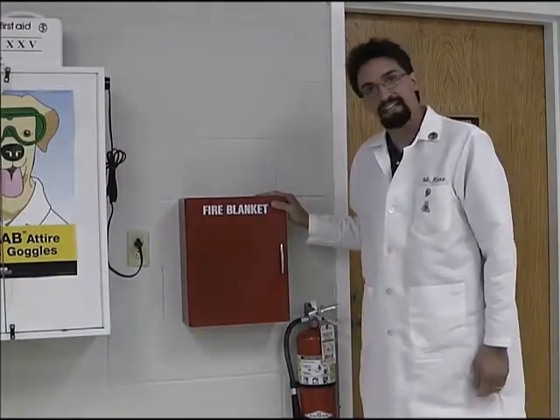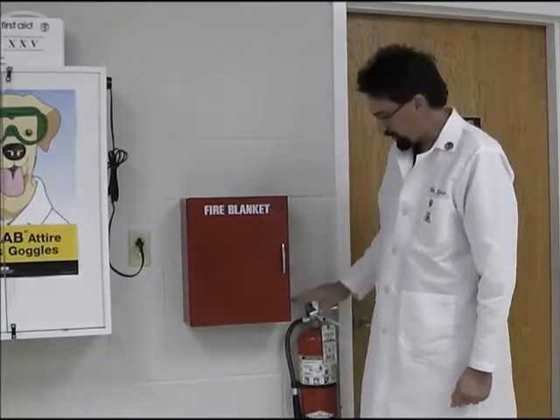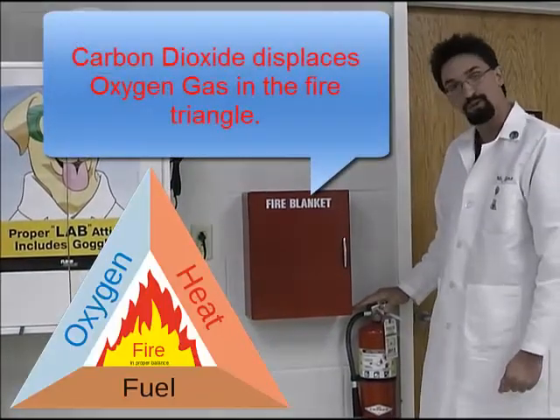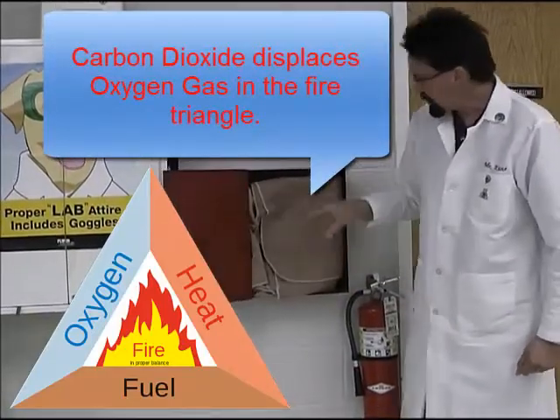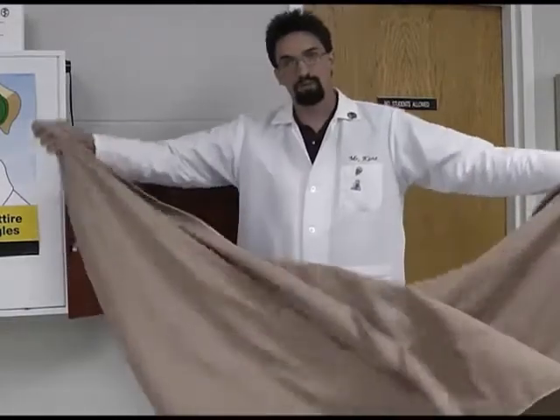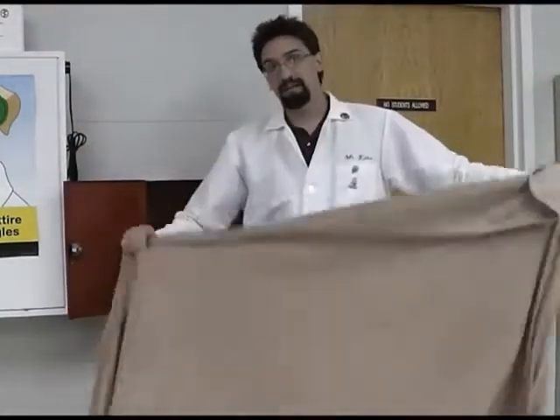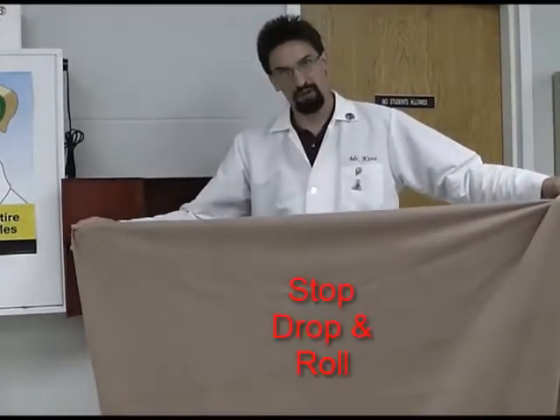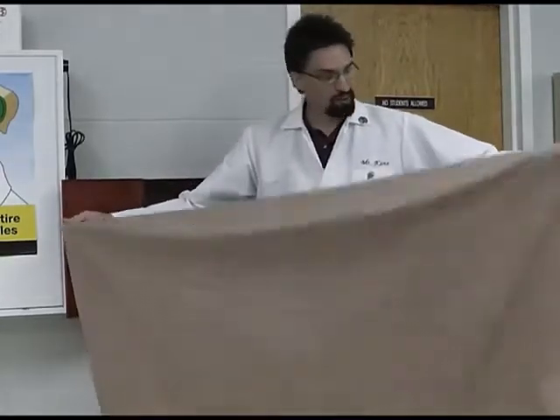The second item here is a fire blanket. If a fire starts on a person, we don't use the fire extinguisher because it uses carbon dioxide, which people don't breathe very well. So we use a fire blanket on a person. It is a pretty simple device — just a nice wool blanket. If somebody starts on fire, you want to, as a lab partner, do what they taught you in kindergarten: stop, drop, and roll. The person who is on fire usually doesn't remember stop, drop, and roll, so you have to remind them, and perhaps sometimes even help them.